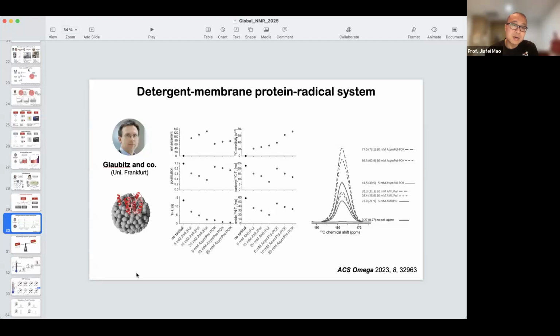The idea at that time is we, of course, optimize the radical concentration, because you usually get from 10 to 20, but want to go a bit lower. And the solvent system is a funny story, because at a certain point I stopped using deuterated glycerol in some applications, because normal glycerol costs nothing, right?